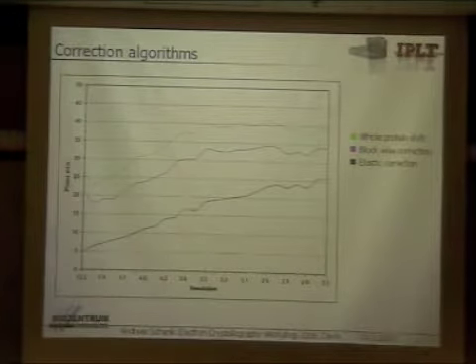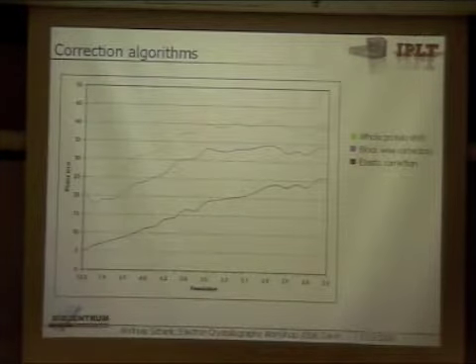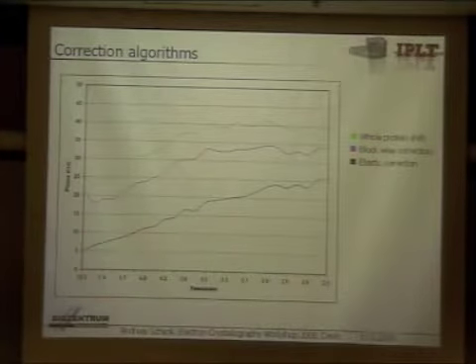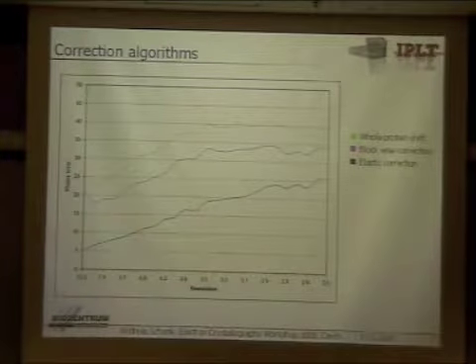But I don't think you're losing them here. I think you're just shifting them. So averaged over the whole crystal, you probably lose them more than you see the shift. Or at the edges of the blocks where you do the shift, you'll be shifting things.